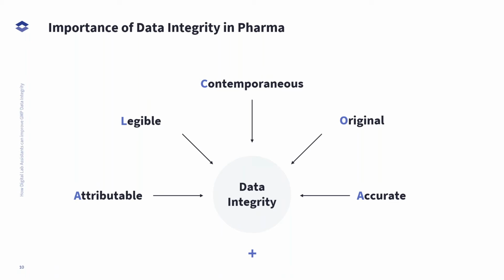And I think Cheryl is actually a big fan of that, because it's very often that ELN systems are running on computers, not at the place where the experiment is actually being conducted. So the operator, in most cases, is writing down notes, which are needed during the work in the lab. But what is happening then is that the lab worker, the operator, is writing down results on a piece of paper. I heard between scientists that sometimes this is also a paper towel, and pasting the notes back into the ELN after the experiment is being conducted.